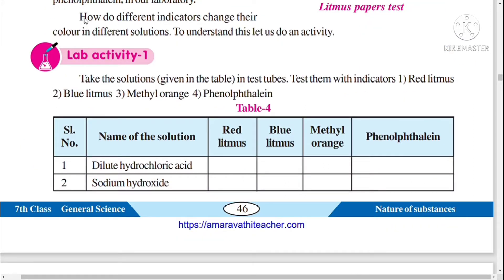Happy morning to all of you. Today we are going to conduct lab activity 1. For this experiment activity, we need some solutions: dilute hydrochloric acid, sodium hydroxide, acetic acid, salt solution, sugar solution, and soap solution. We need 6 solutions.